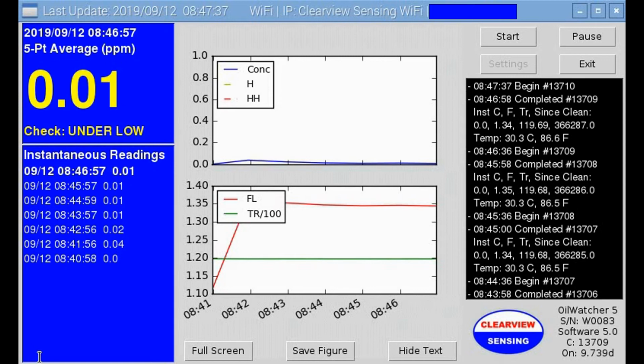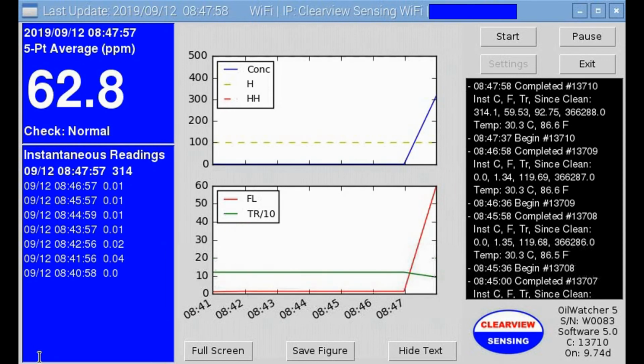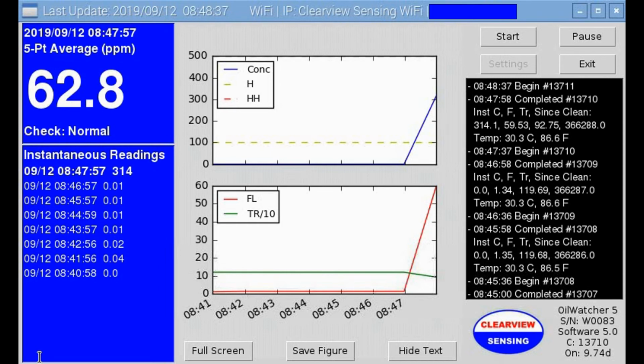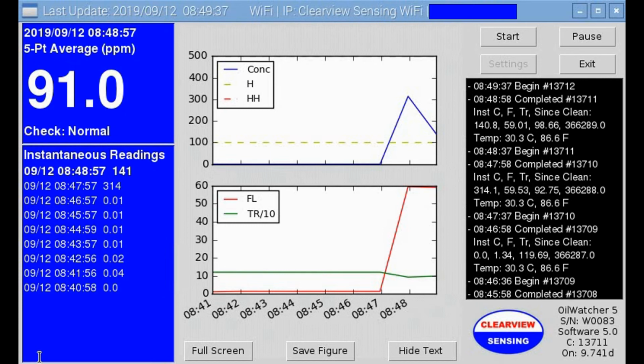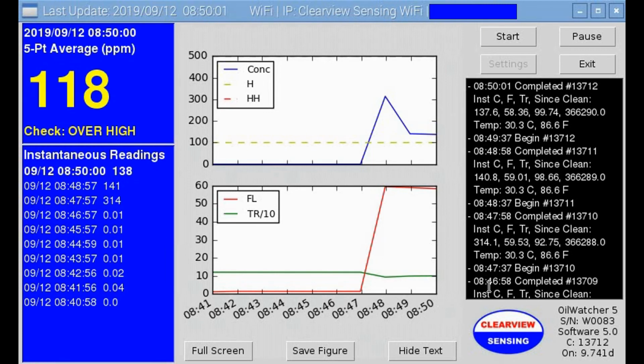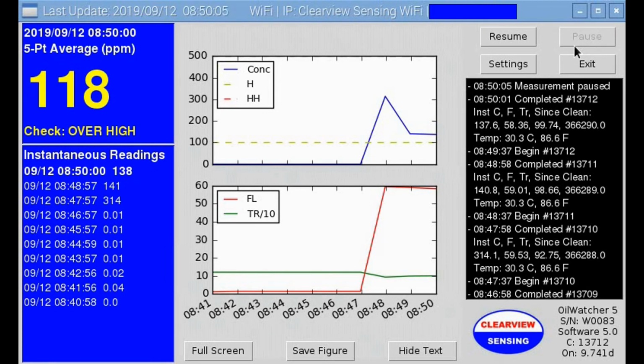When oil is detected in the process water, the optimal timing to grab a sample is when the oil content is stable. This is done by waiting for two close readings, taking a sample, and then confirming that the third reading is also close. The light values of the second and third readings can then be averaged for input into the calibration file. With two similar readings, the measurement can now be paused.